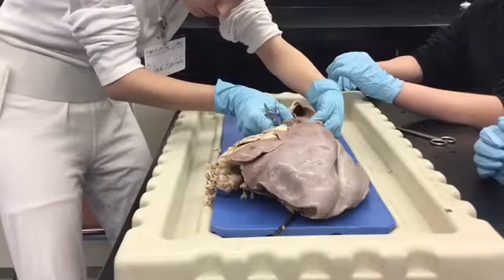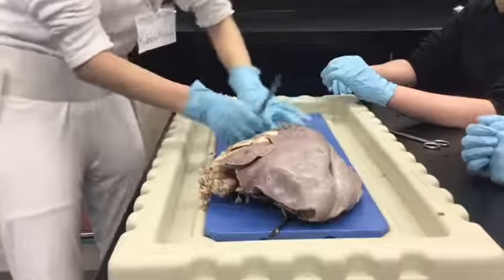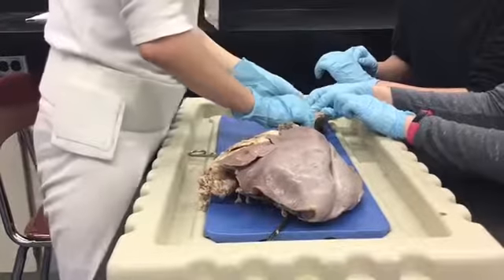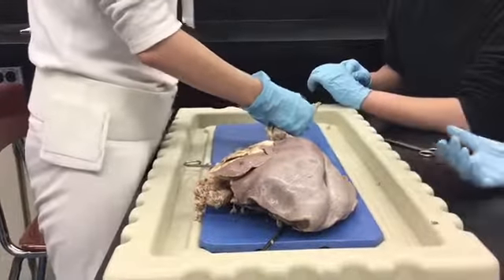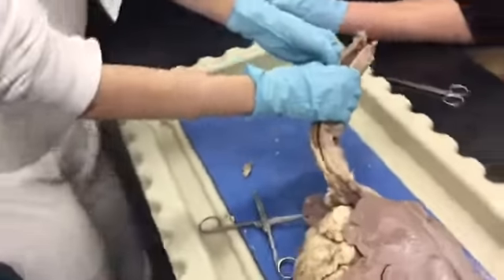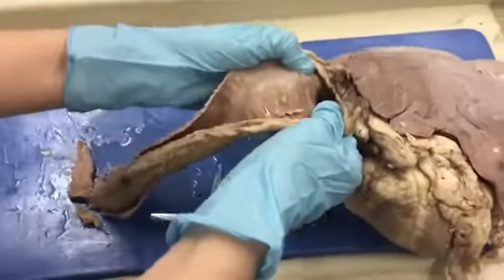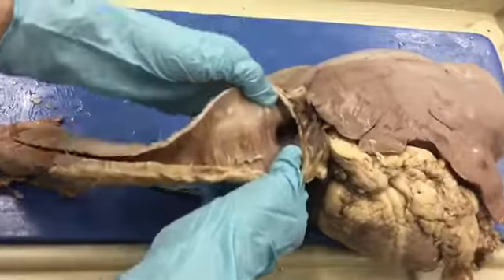There it is! The two holes! Ooh. Cool, I'll put my finger on them. It's cool that from here you can see the inside, yes. Come here. Get over by my shoulder so I can get a good view. There is the two bronchi.